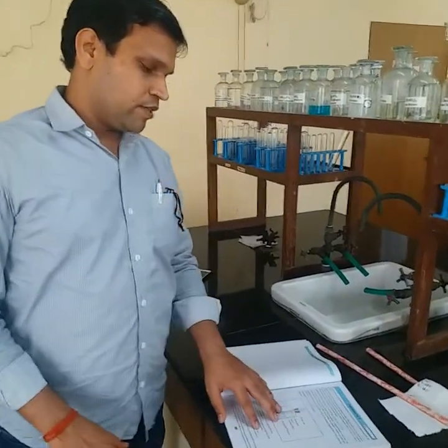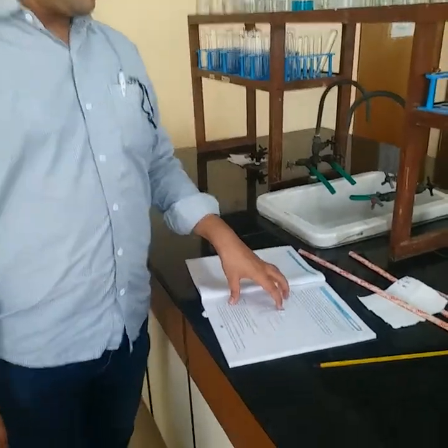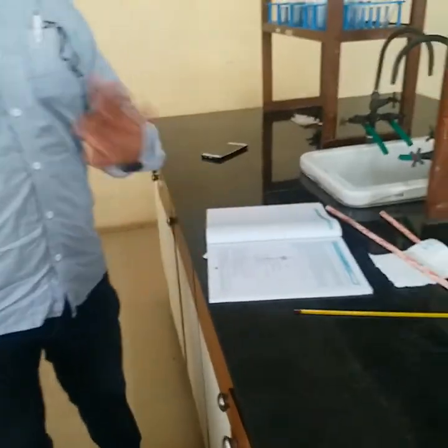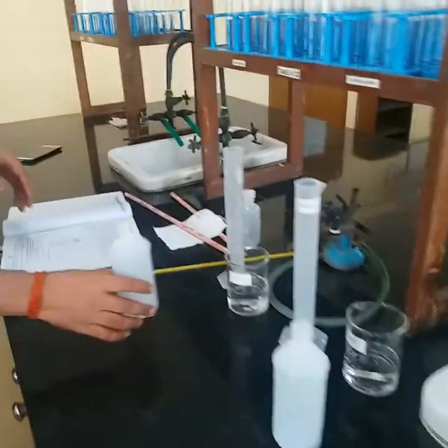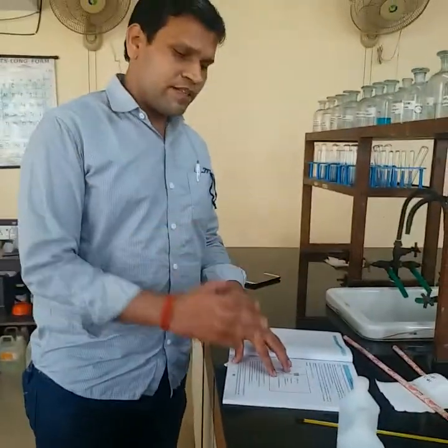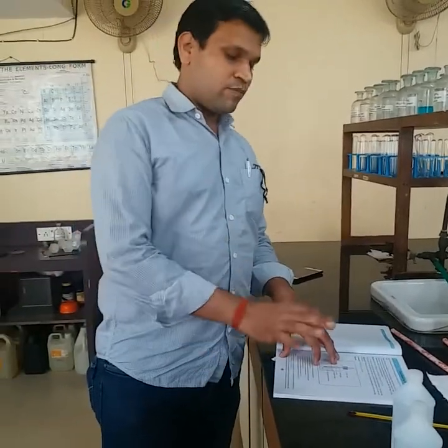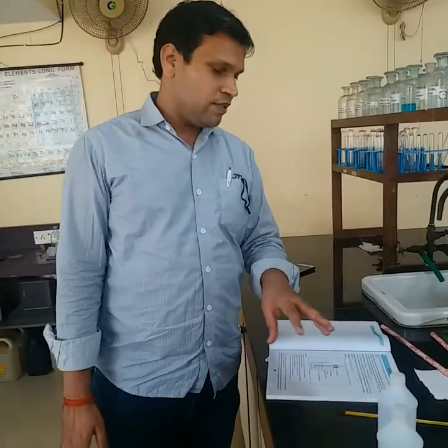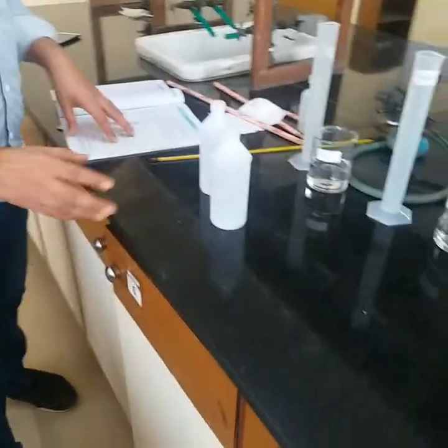Hello students. Today we are going to demonstrate one of the important experiments of chemistry, that is the heat of neutralization. We are all aware of what a neutralization reaction is. When acid and bases react, we get a salt and water, and at that time some amount of energy is released into the atmosphere. The main aim of this experiment is to determine the enthalpy of neutralization of a strong acid and strong base.